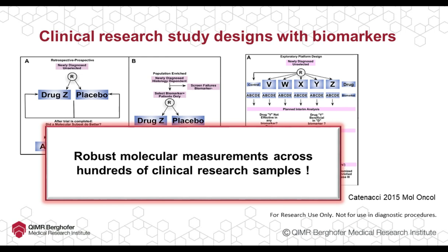However, at the end of that, it may not be possible to apply particular measurement techniques across hundreds of samples reproducibly. Hence, in a clinical research setting, trying to measure a lot of proteins across different samples, one may need to come up with a different strategy.